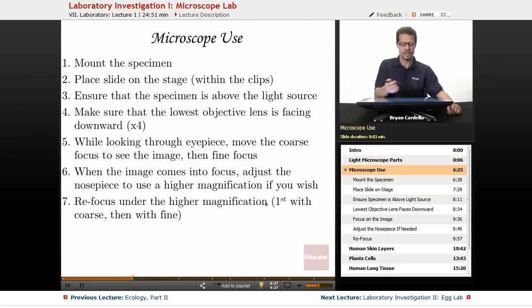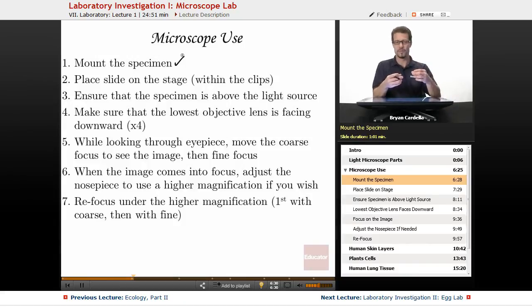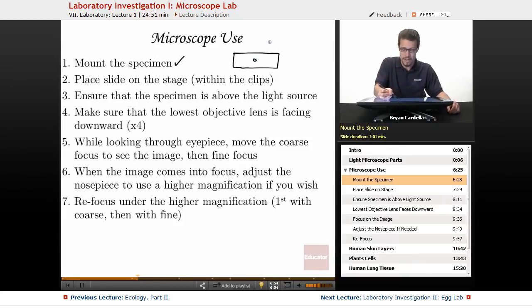All right, microscope use. So first you've got to mount the specimen. A lot of the specimens I use in my classroom actually are pre-made. They're tissues that have been in the slide and preserved in the slide for years. But I also have students make their own slide. So you take that kind of rectangular glass slide with a medicine dropper or a pipette. You can take cells out of an aqueous environment if you're doing a protist study. Put a drop on the middle.